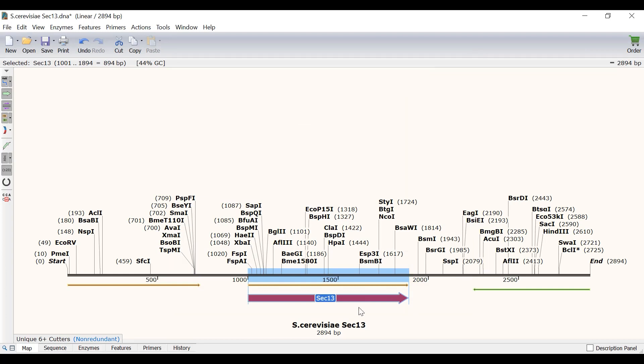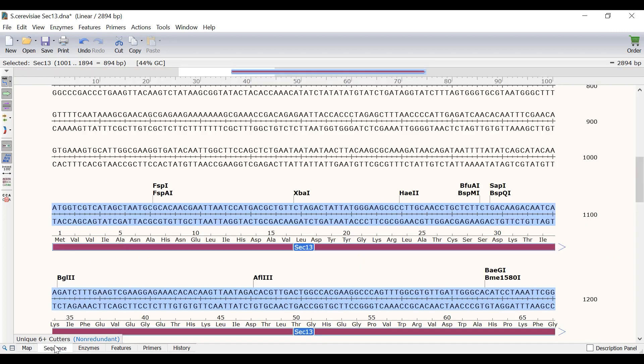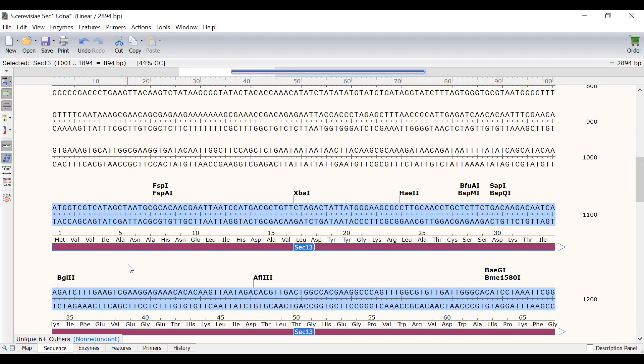You can see that a feature has been added as indicated by the purple arrow named sec13. I can now turn off the open reading frames by selecting the show translations button. So only the sec13 feature is now visible. And if I switch back to the sequence view you will see that the amino acid sequence is only displayed above the feature. Sec13 is a simple example to use for working with translations in Snapgene since it has no introns.